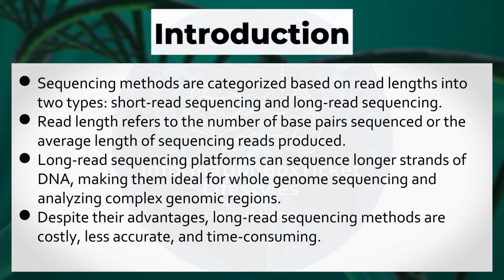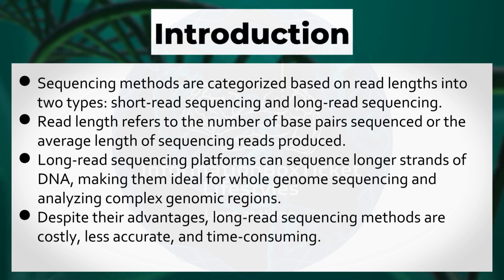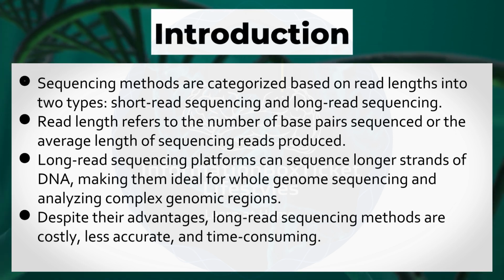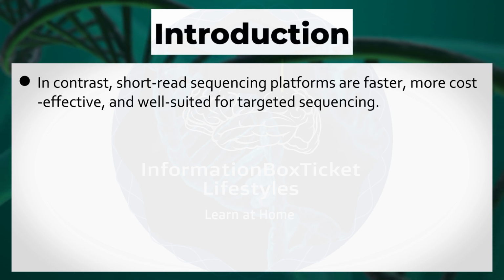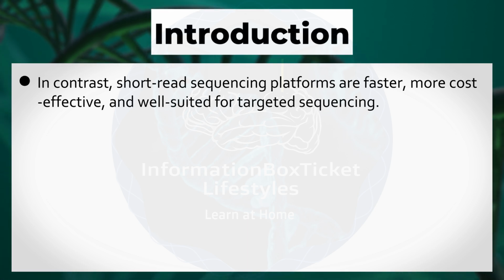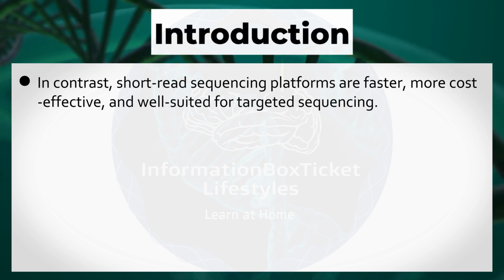Despite their advantages, long-read sequencing methods are costly, less accurate, and time-consuming. In contrast, short-read sequencing platforms are faster, more cost-effective, and well-suited for targeted sequencing.